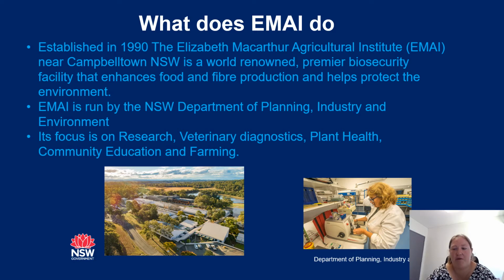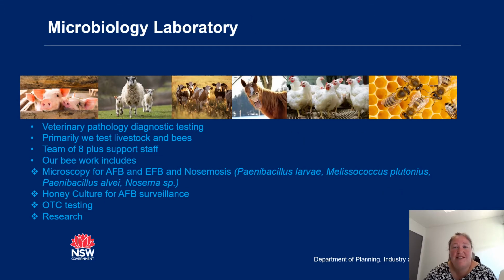And we have a number of labs on site, including virology, serology, parasitology, microbiology, genetics, plant and soil health laboratories, and importantly for today, we have two labs working on bee disease diagnostics and research, and they are the virology and microbiology labs. Today, I'm going to be mostly focusing on the work in the microbiology laboratory, which is the laboratory that I work in.